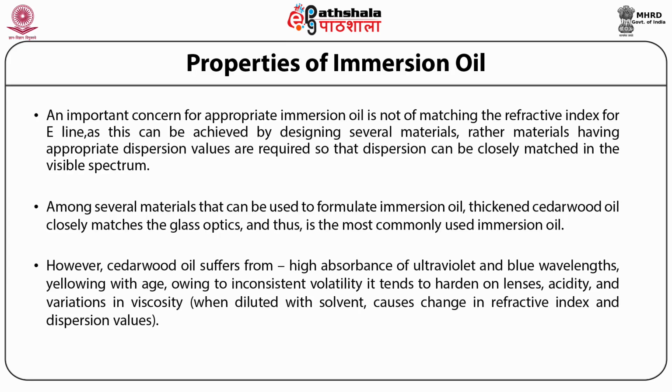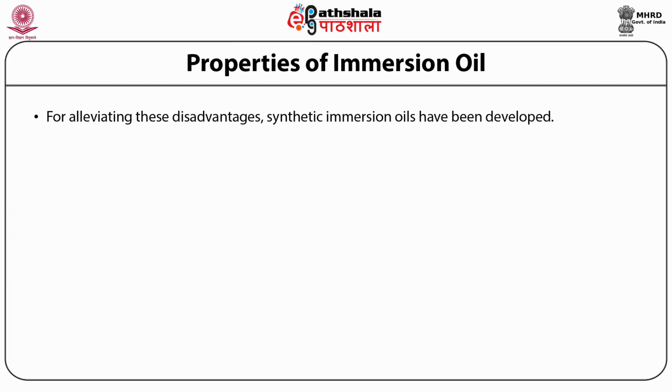However, cedar wood oil suffers from high absorbance of ultraviolet and blue wavelengths, yellowing with age, inconsistent volatility as it tends to harden on lenses, acidity, and variations in viscosity. When diluted with solvent, it causes change in refractive index and dispersion values. For alleviating these disadvantages, synthetic immersion oils have been developed.